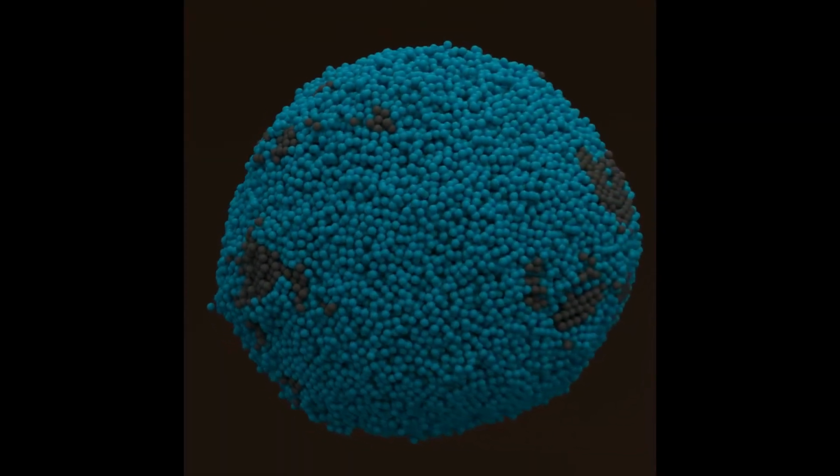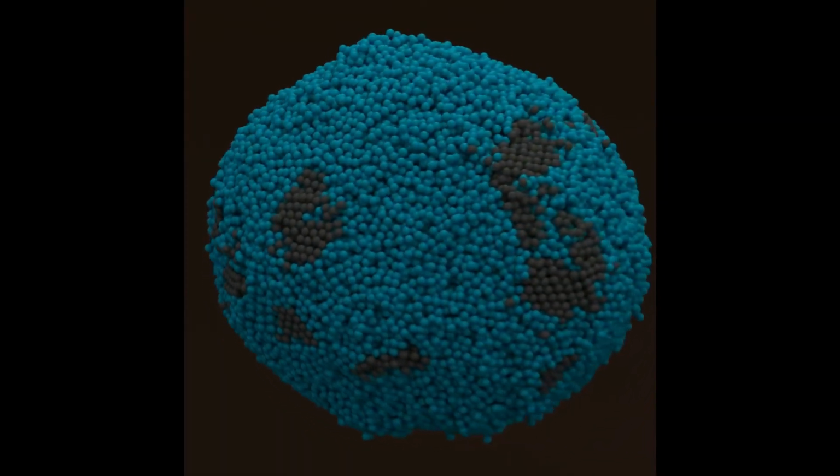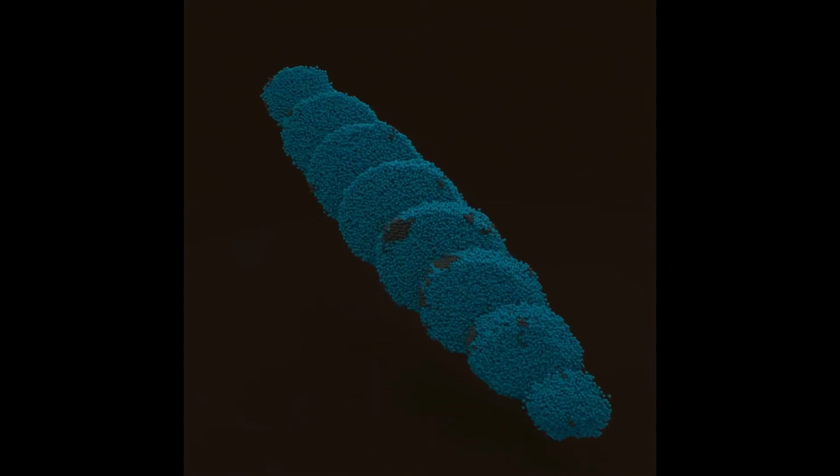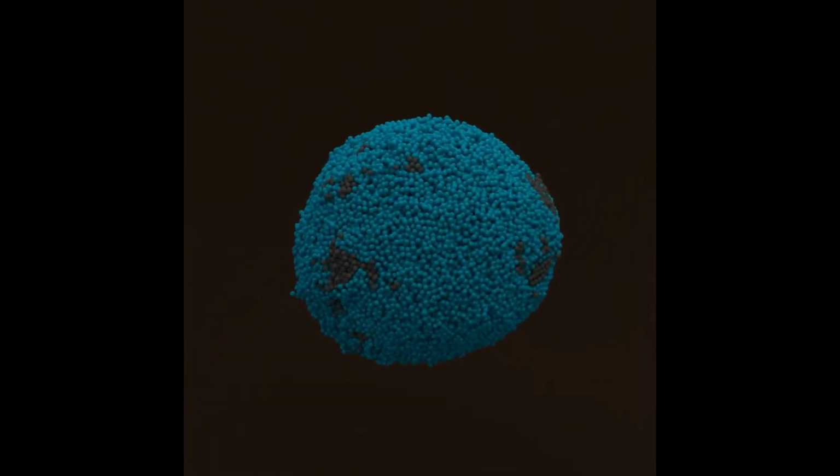And so here shows one amorphous material. This is more than, I think, 20,000 atoms. This is like a small protein, a protein molecule. And you can see these atoms. The darkest colors are actually the nuclei, but most are just amorphous.